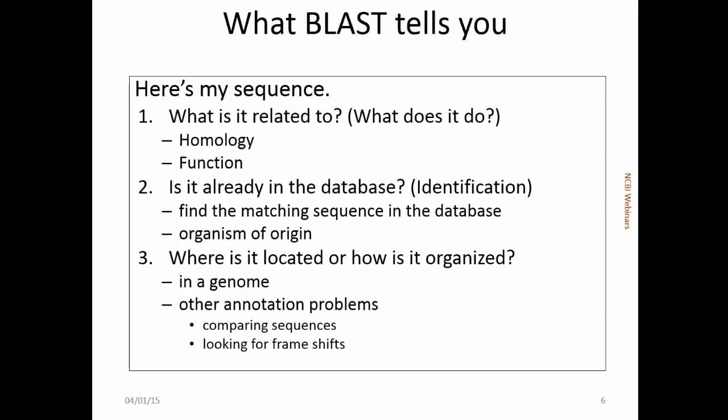So one way of thinking about what BLAST tells you are the kinds of questions that people are asking. The first question is sort of the one that BLAST was intended to do in the first place, and that is, what's my sequence related to? And a related question to that is really the one that people usually want to know when they ask that question, is what does my protein sequence do? So that's about homology, what's it related to. And it's also about function. Homology does not necessarily mean that the two things have the same function, but we often make that leap, and there's a kind of BLAST called RPS-BLAST, or conserved domain database search, that might be a little bit more informative when we're thinking about function.